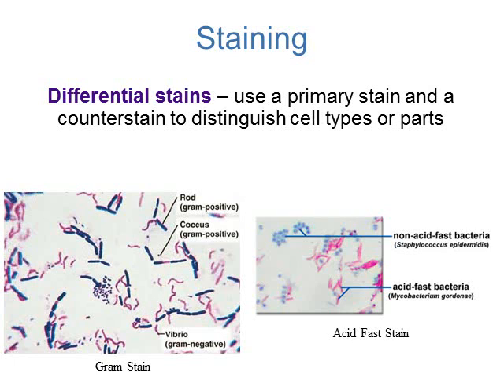Another type of differential stain we're going to be using is an acid-fast stain. These are good at identifying acid-fast bacteria; Mycobacterium is an example. In the acid-fast stain, you have a pinkish primary stain, and then your counterstain is going to be methylene blue, which causes anything that's not acid-fast to appear blue in color. These have multiple steps, so you're really going to have to pay attention. It takes a lot of practice to get a really good stain out of this.